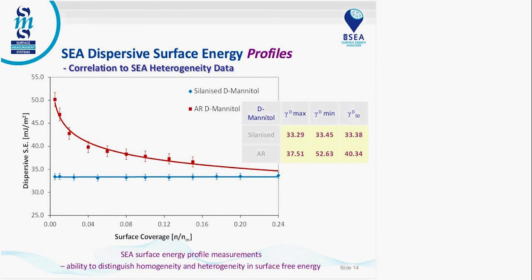Experience with carbon blacks? We do have experience with carbon blacks. Again, with carbon blacks, you would probably have a difficult time getting data at room temperature. You most likely would have to go to maybe 60, 70, 80 degrees C to get reliable retention data. Otherwise, you have to use such a small amount of material, it's not really practical. You may only put 3, 4, 5 milligrams, and that's not really representative of the material. So for carbon blacks, we often go to 60, 80 degrees C, so the probe molecules elute at a much more reasonable time. Otherwise, the peaks take too long to come out, and they're too broad and too flat.